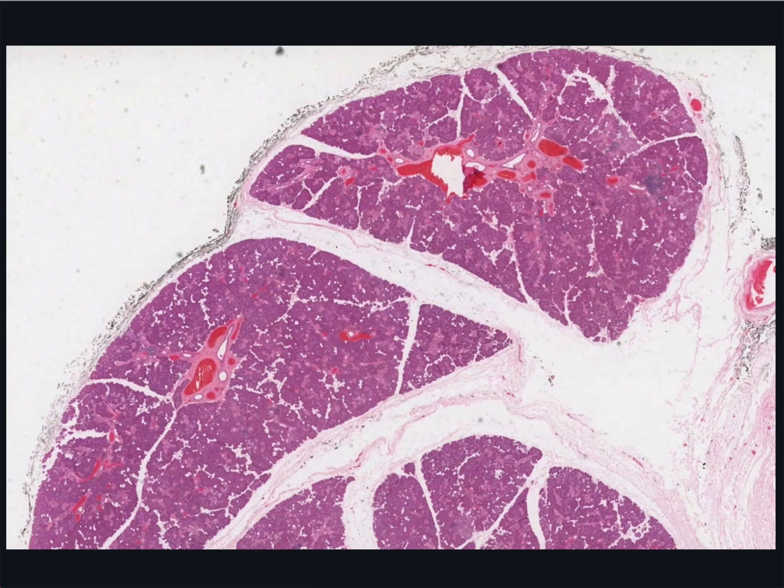The parotid is a branched acinar, actually tubuloacinar, all-serous secreting gland. Its lobular divisions are clearly visible in this image, exaggerated by tissue shrinkage, as well as profiles of sections through blood vessels and excretory ducts.